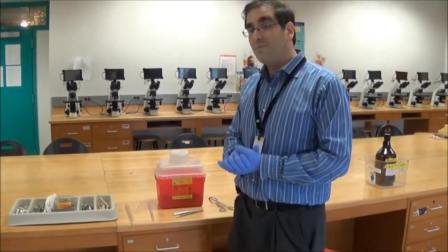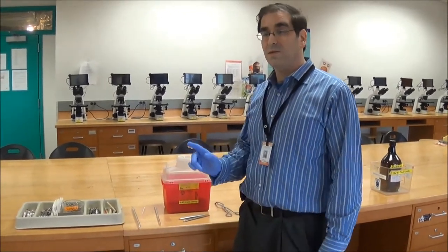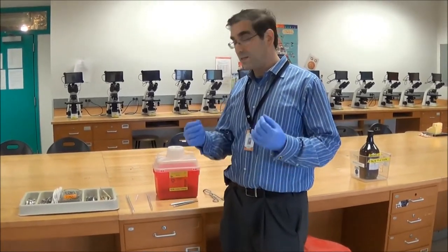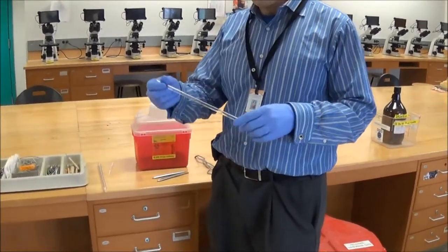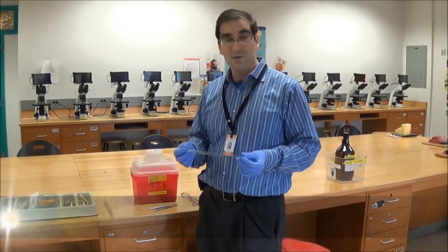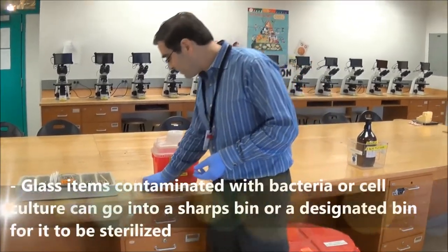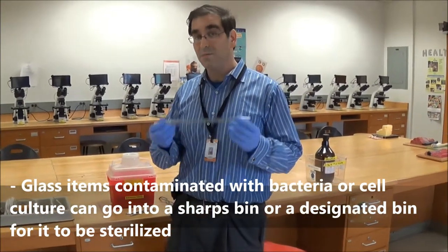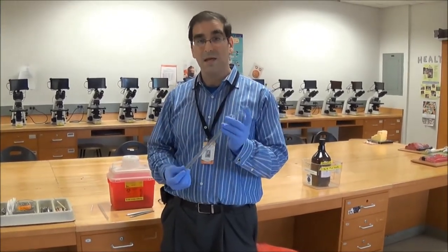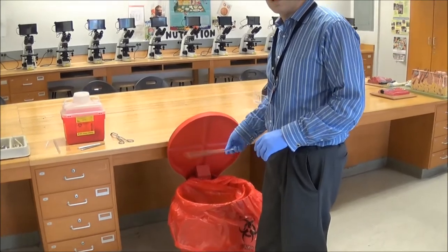The distinction between glass waste containers and bio waste containers is whether or not something glass has been exposed to a biohazard. So if you have a Pasteur pipette — a glass type pipette — or a serological pipette that's glass and has been used with some sort of biohazard, such as a hazardous chemical or bacteria or tissue culture, those items would have to go into the sharps biohazard container. However, some serological pipettes are made out of plastic. Plastic pipettes are not considered sharps — they're dull on the end and would not pierce the bag — so those would be disposed of into the larger biohazard solid waste container.